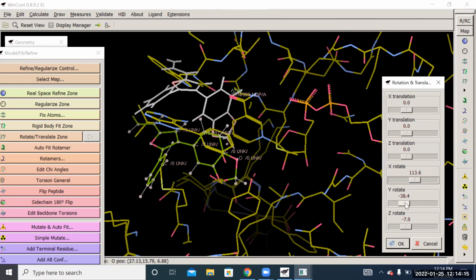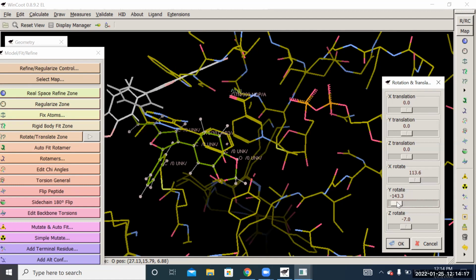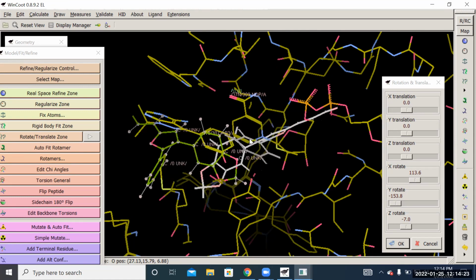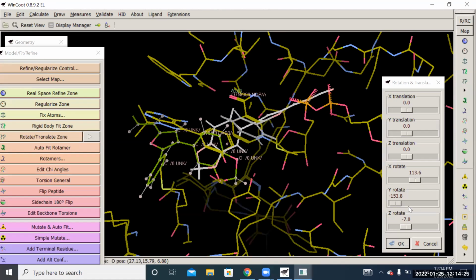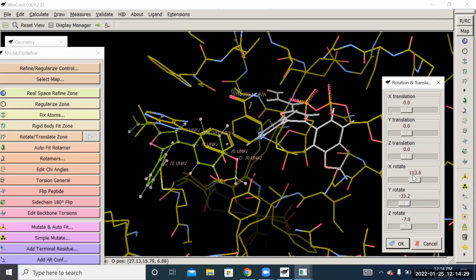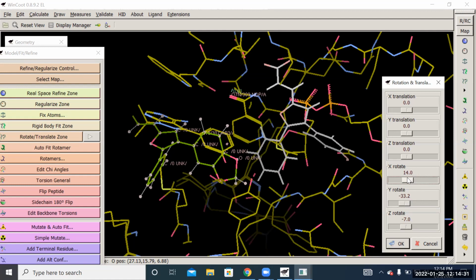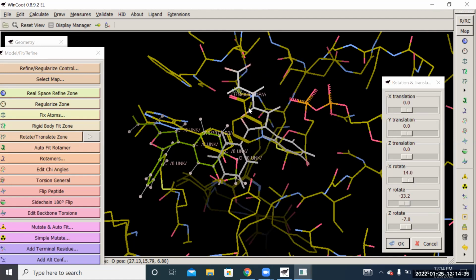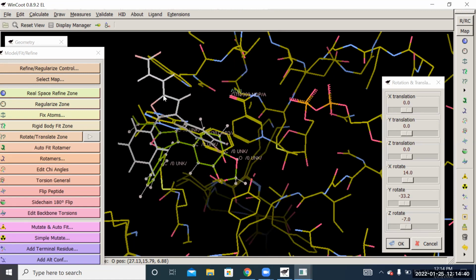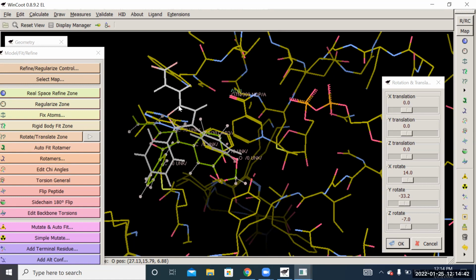I guess I want to move these things out. See how easy you can get all messed up. It's pretty easy to do, actually. So I'm trying to picture how to manipulate this so that I can get it where I want it, which is non-trivial, to tell you the truth.